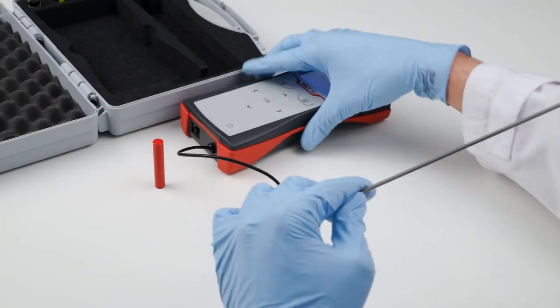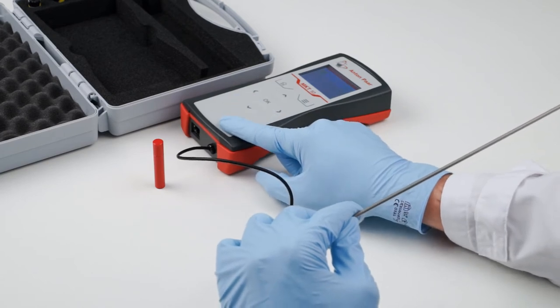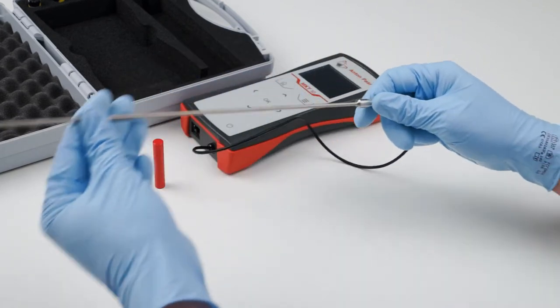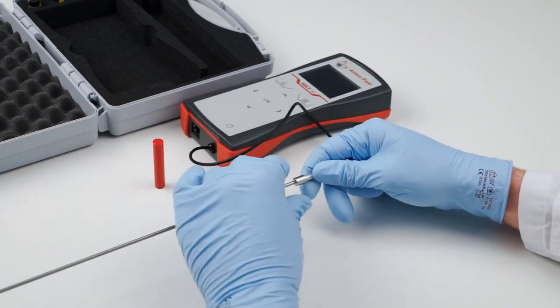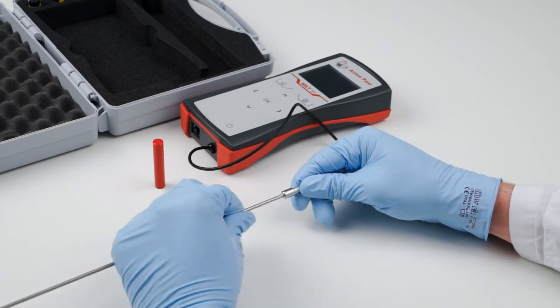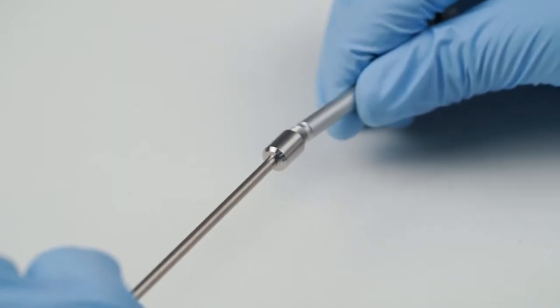After the measurement, turn off the device, carefully remove the protection tube, mount the protection sleeve, and store the sensor and the instrument in the transportation case.